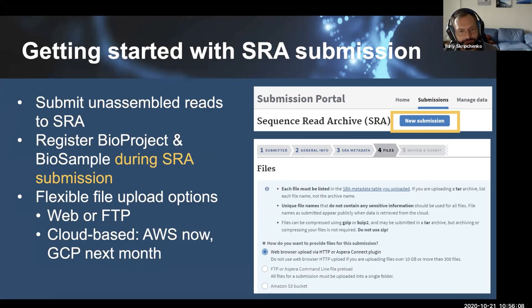And of course, we have the same programmatic submission pathway as GenBank. So we use the same kind of backend system to do all of the submissions programmatically. So should you want to submit 10,000 or more samples at the same time or over the next year or two, that is definitely a great way to go about it. So you can drive your submissions off of your own LIMS or database that you use for storing and organizing your own internal data sets. Next slide, please.